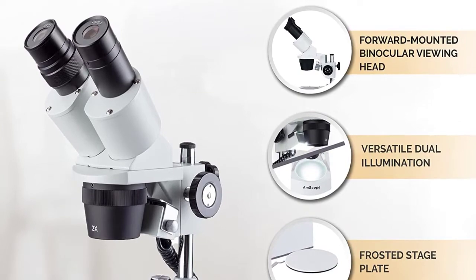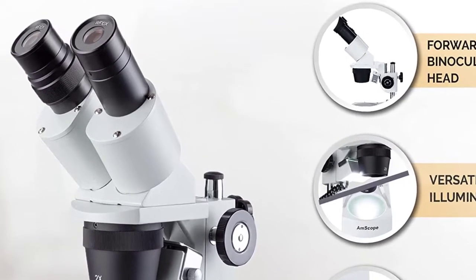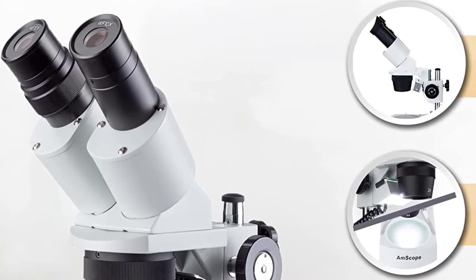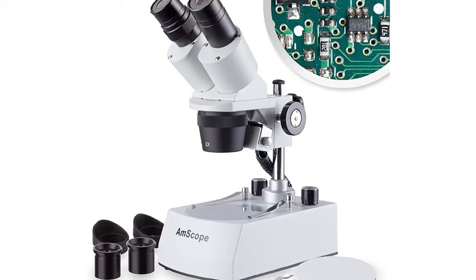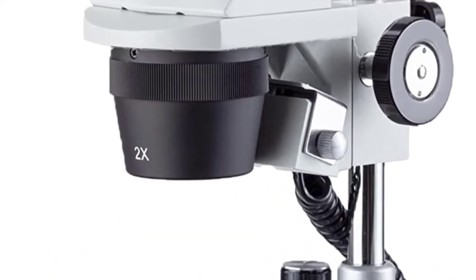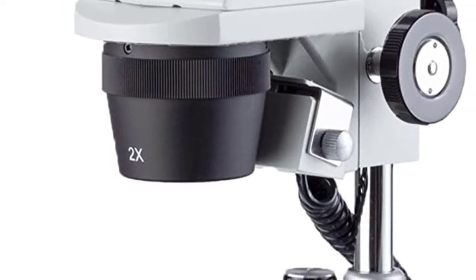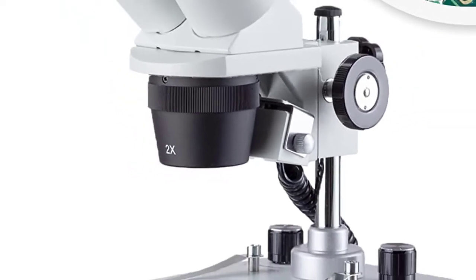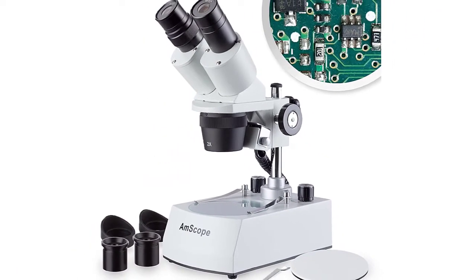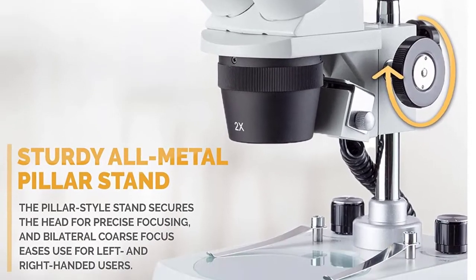Stereo microscope for home or classroom use — enables students and hobbyists to inspect biological specimens, rocks, stamps, jewelry, and large specimens that require handling or manipulation. Forward-mounted binocular viewing head with interchangeable 10x and 20x wide field eyepieces, adjustable interpupillary distance and 45 degree inclination. Interchangeable 2x and 4x objectives provide low magnification and longer focal length for inspecting large-scale specimens.